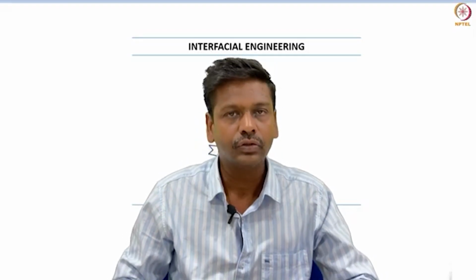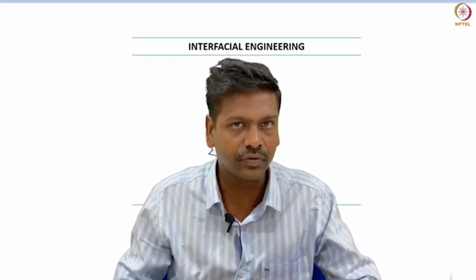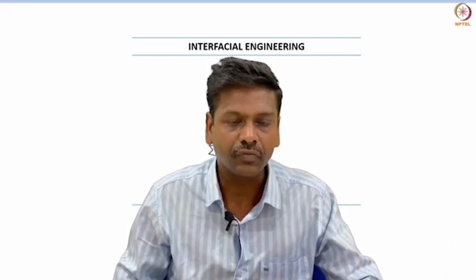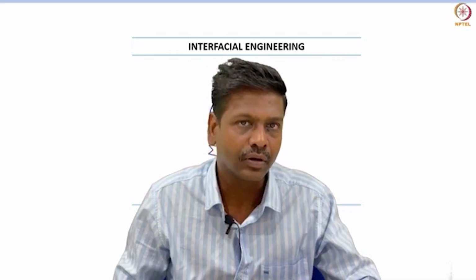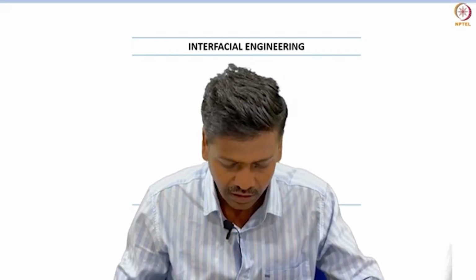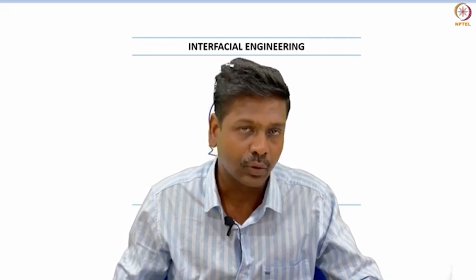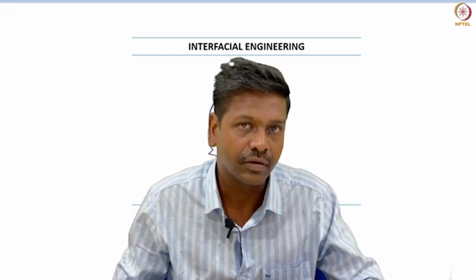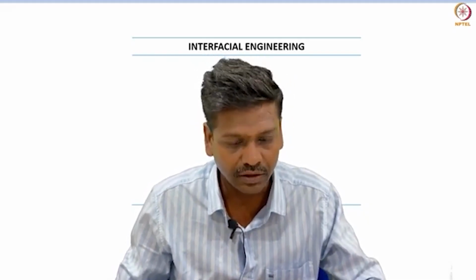Welcome back. So in today's video lecture, we will be looking at the demonstration of force tensiometer. So far we have been discussing various measurement techniques. In today's lecture, we will look at the working principle and the demonstration part of the force tensiometer.